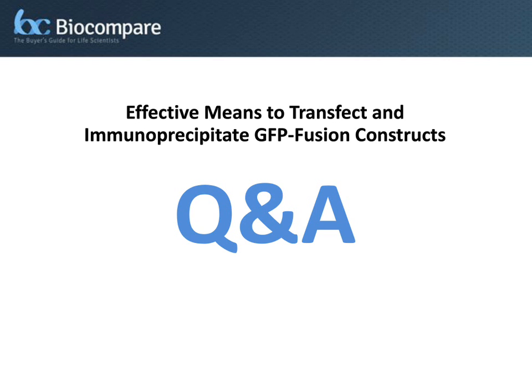When this is not the case, it's often preferred to use viruses, sometimes a replication-competent virus such as RCAS or lentiviruses, depending on what your application is. The limitation of the viral approaches is that, particularly with replication-competent viruses, you don't have very precise control over the region that you're targeting, because eventually the virus tends to spread everywhere. So in those cases, when it's possible, I think electroporation makes sense.